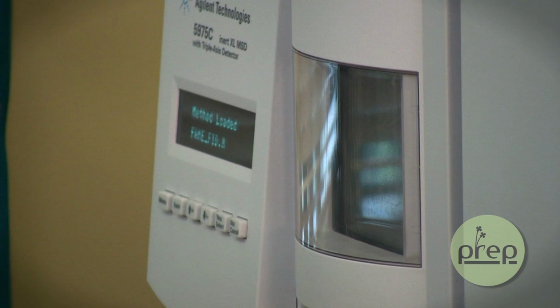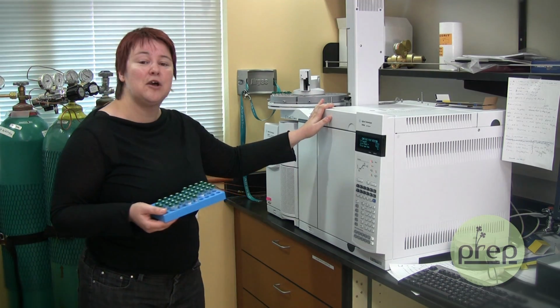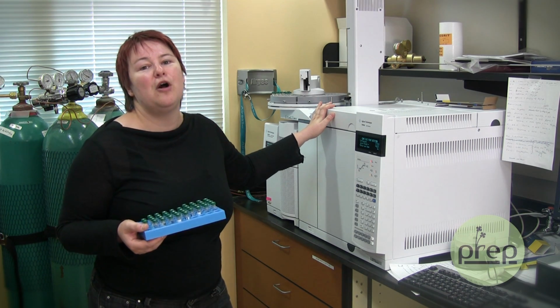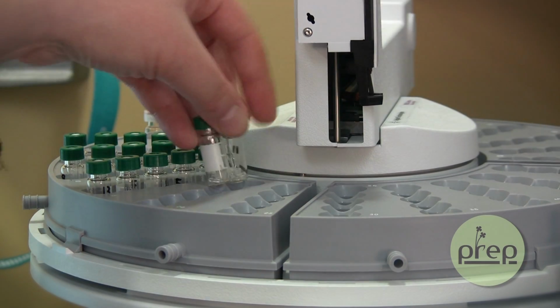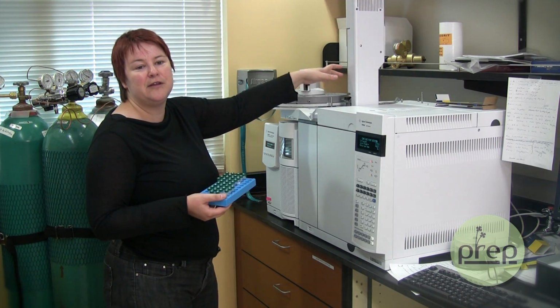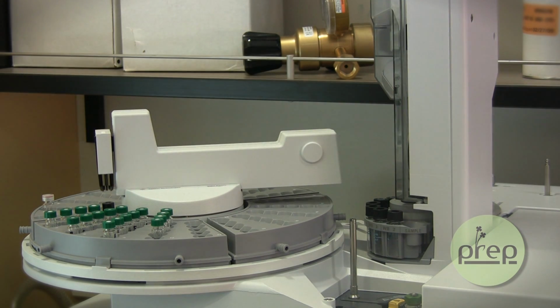Alright guys, so now we're ready to analyze the seeds and see if there's any changes in oil levels. And this is the machine that we do it with, and it's called gas chromatography mass spectrometry, or simply as we call it, GCMS. And so we can load our samples here in the tray, and then the robotic arm will bring it into this tower where the sample is injected in the machine and analyzed.